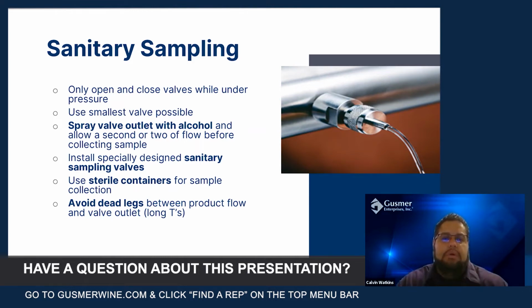You want to definitely install specially designed sanitary sampling valves, and we'll see what that looks like later on. Those are great tools to use as your sample valves. You want to use sterile containers for sample collection, and again, avoid those dead legs in the process.